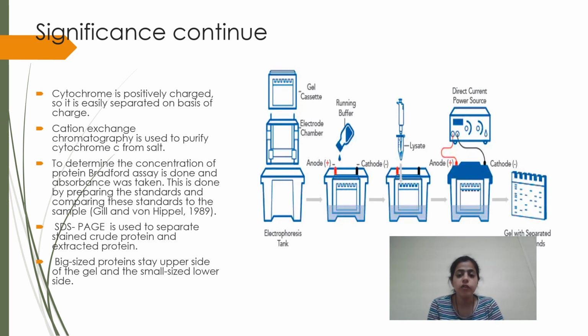Well, the separation of the protein in its native condition is very hard. So electrophoresis is a good option to separate the protein. Here we are using SDS, sodium dodecyl sulfate. It is an ionic detergent which strongly binds to our protein and helps to separate the protein.